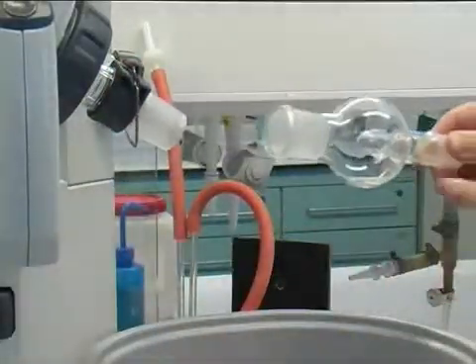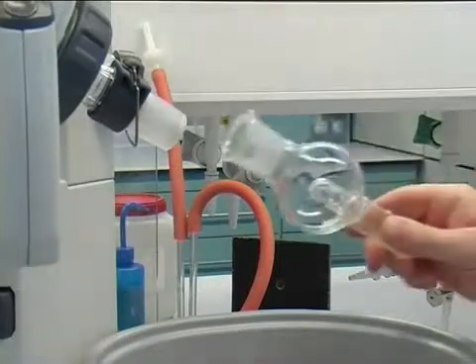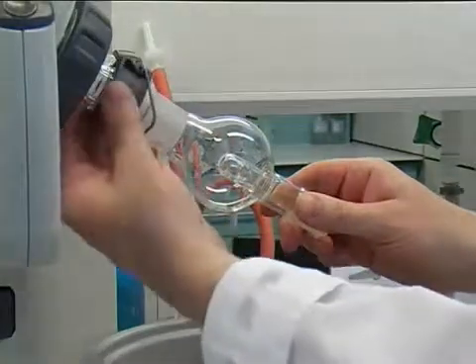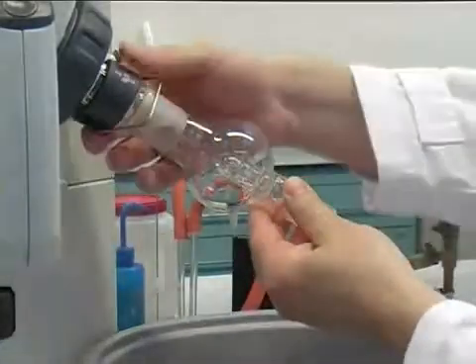Empty and wash that into the solvent waste. And once you have done that, reattach the splash guard. Again using that part at the top. Don't tighten it too tight, just so that it stays on the rotary evaporator.